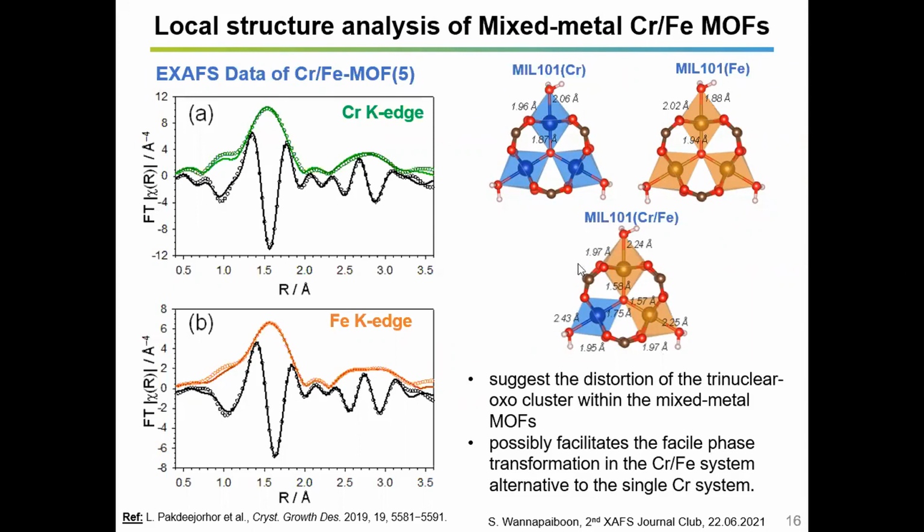So this is also the information that we get that can track back the mechanism of why we can get the deviation of polymorphisms of MOF with the same metal clusters and also the same organic linkers, in the synthesis using the same kind of synthetic reaction with the microwave.